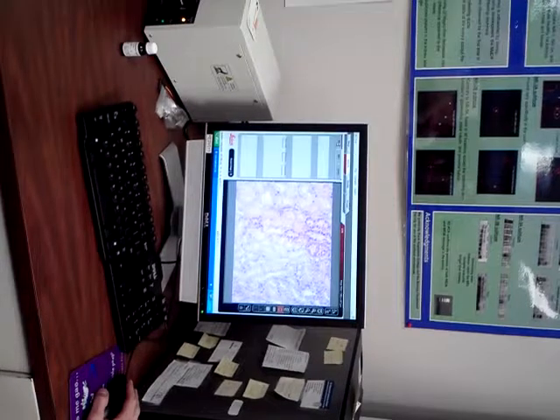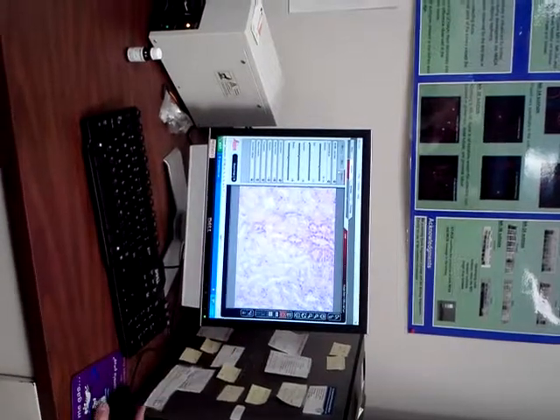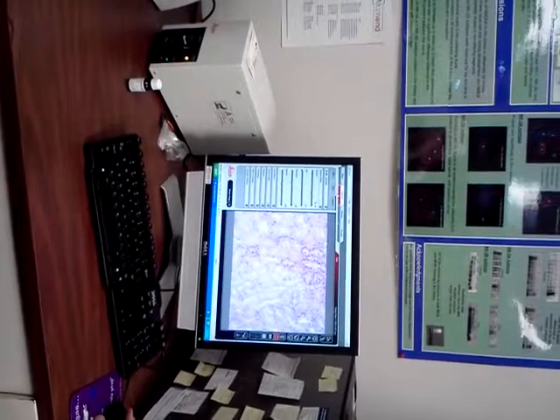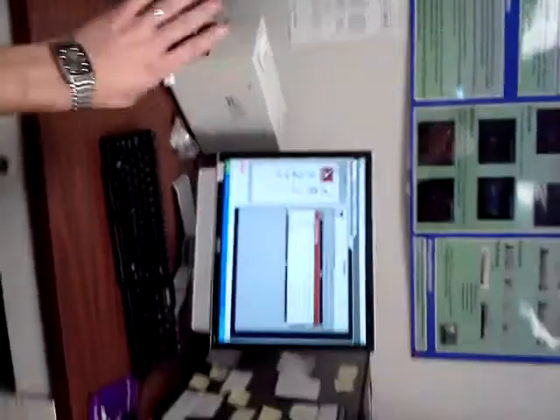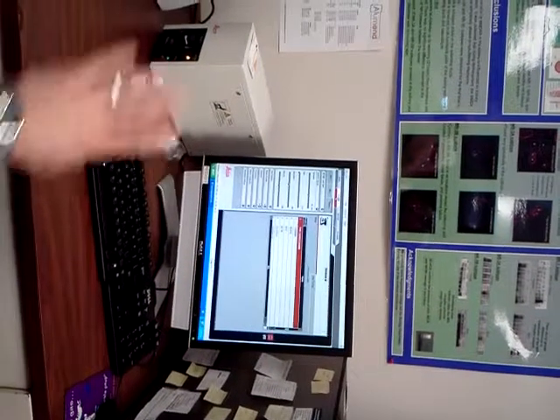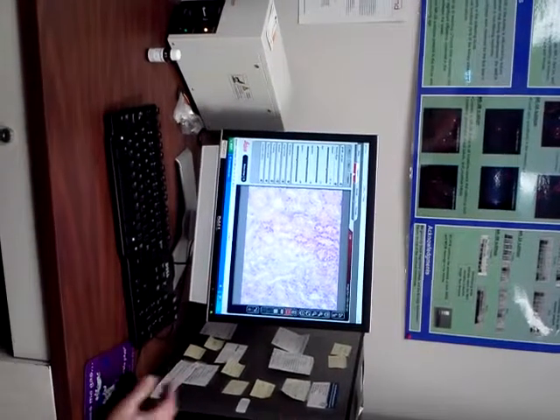But I'll go back in. Okay, so here you open up your program, and it pops up, and then it looks like this is all sort of tab and menu driven. So setup is already done. Don't go into setup. It's basically me telling it what is on the microscope. Yeah. And since this is connected to the computer and there's a nice crosstalk, it's auto calibrated.